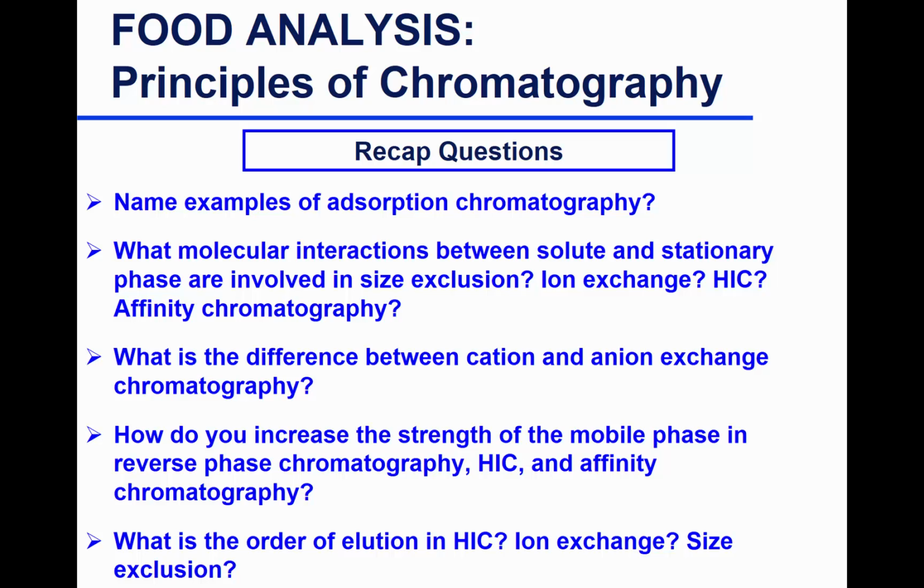Okay, let's name a few examples of adsorption chromatography. No, okay, let me clarify. Different modes of separation that are also adsorptive chromatography, not the stationary phase or mobile phase. Different modes of separation, Erica?